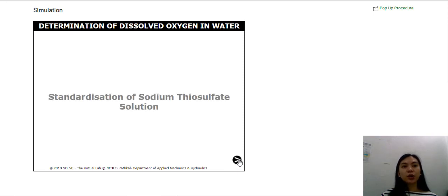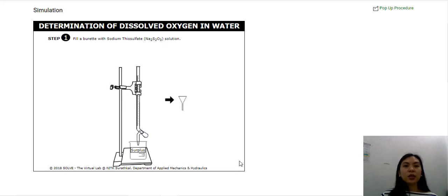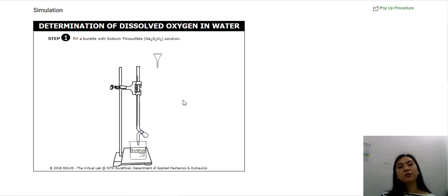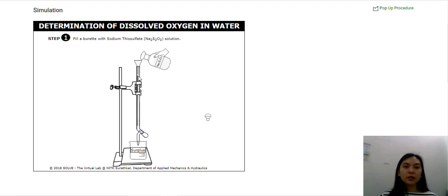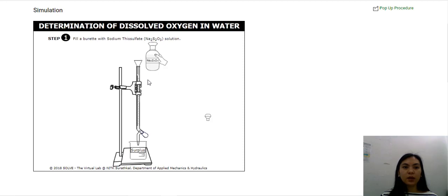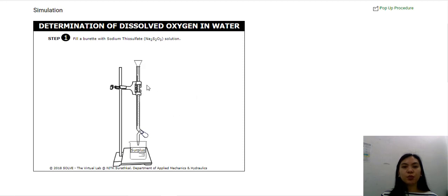The first part of this activity is to standardize your sodium thiosulfate solution. Fill a burette with sodium thiosulfate solution — click on this funnel, then remove the cap of the sodium thiosulfate solution and fill the burette until the initial reading. Once it's completely filled, replace the cap of your sodium thiosulfate solution and remove the funnel.